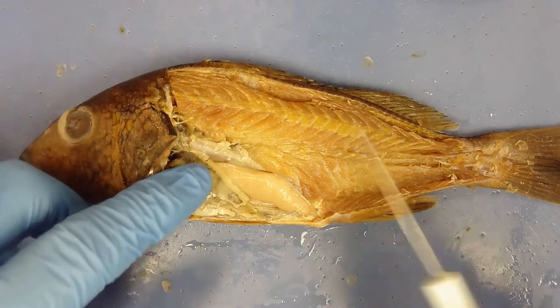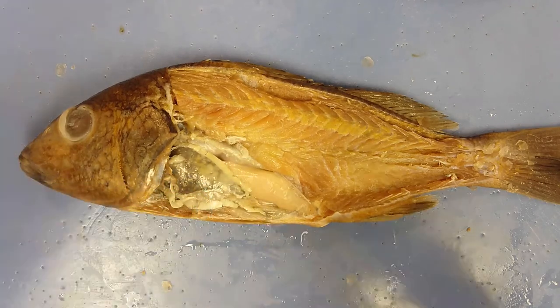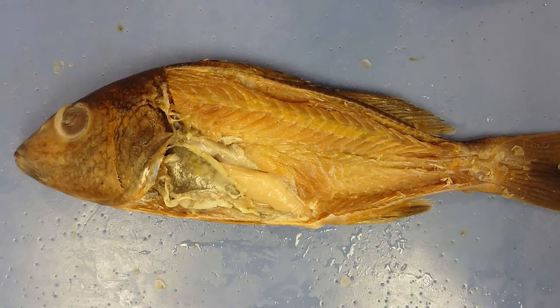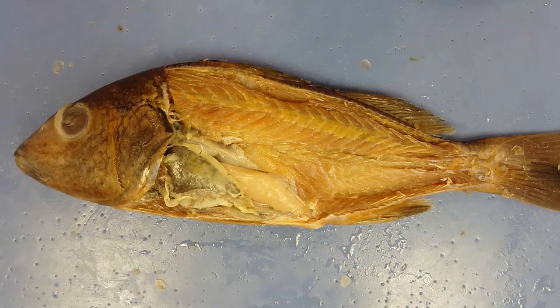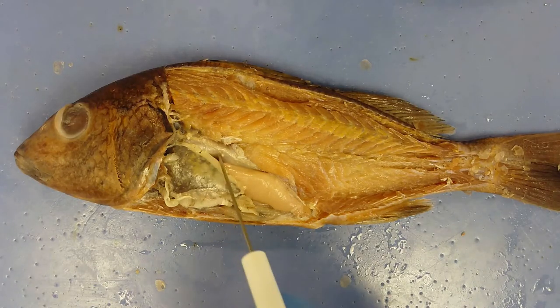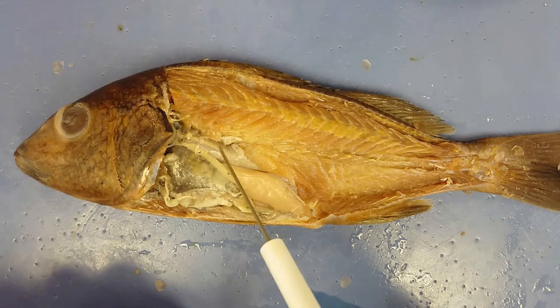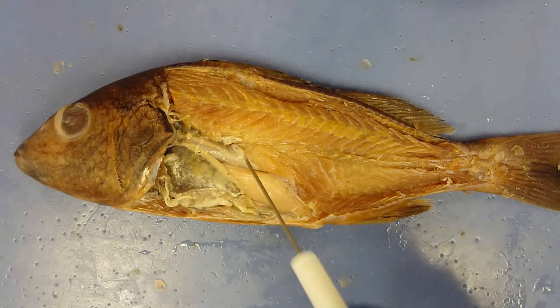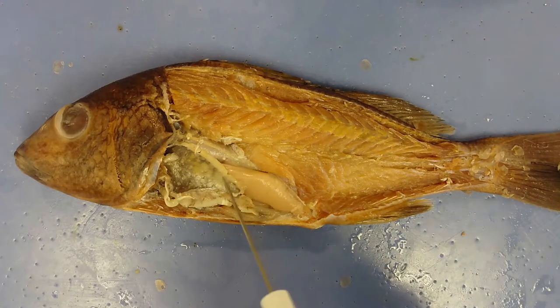Moving the liver aside reveals a really shiny silver structure — the swim bladder. This is filled with air when the fish needs to be buoyant and loses air when the fish sinks. It acts like a buoyancy device. The swim bladder is surrounded by capillary beds — to increase buoyancy, the fish releases air from its bloodstream into the swim bladder; to sink, it dissolves that air back into the capillary beds and bloodstream.